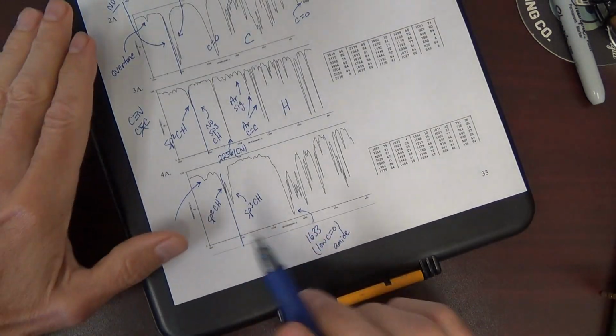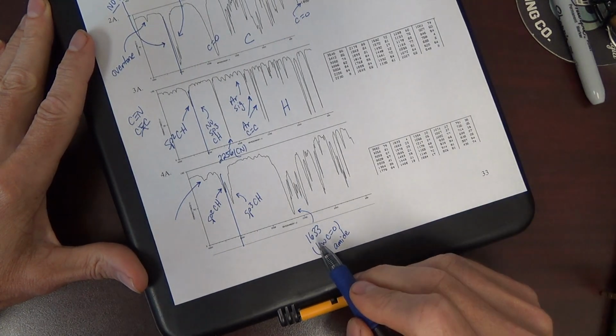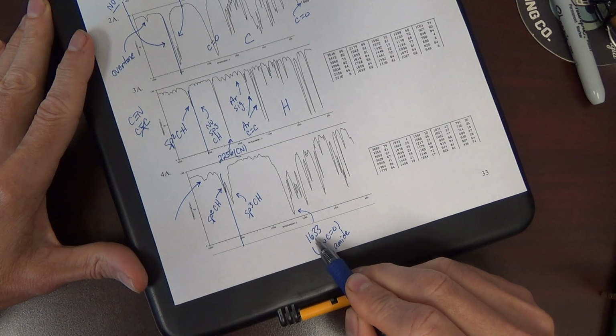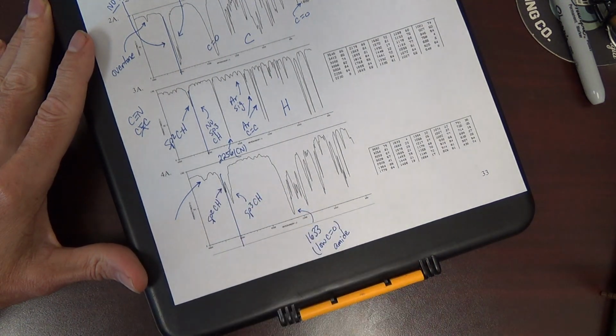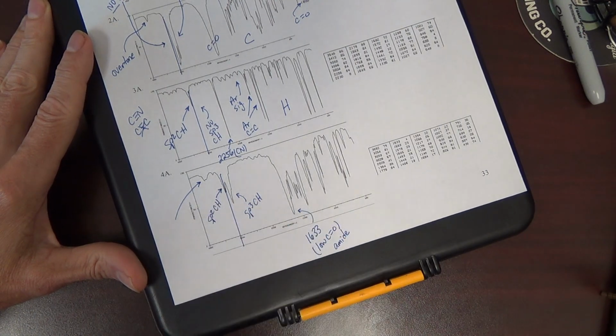But it's not an intense peak. This is even weaker. I don't think that's a peak. It's a little water or overtone, although overtone would be double minus a touch. That's 3266 minus a touch. That's higher than that. Don't let that confuse you. That is not an amide NH.